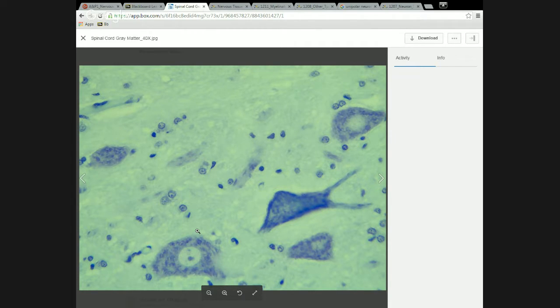You may hear reference to Nissl bodies. That's just a microscopist's name for the rough ER, because rough ER stains in a Nissl stain. So when you see them, or if you see Nissl bodies, it's just saying that texture pattern that we see inside the cell.